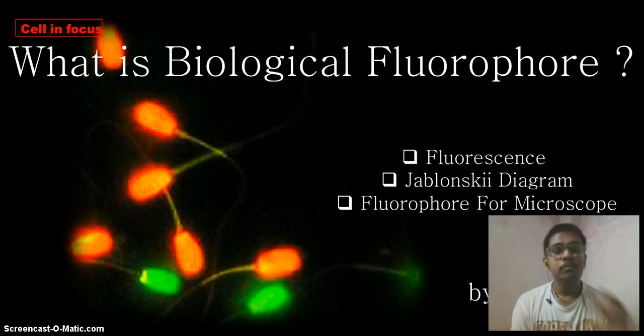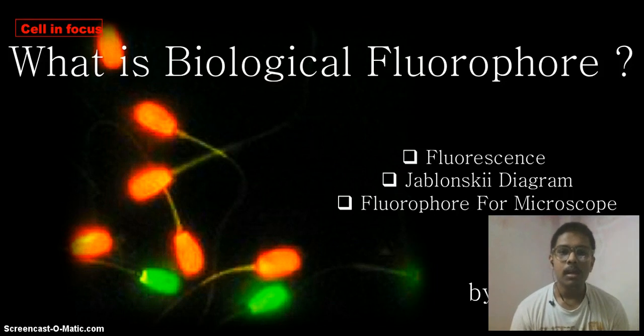To answer that, there is a phenomenon happening which we call fluorescence. The fluorophore is making that incident, that's why it's called fluorescence. Fluorescence is a molecular level phenomenon by which a fluorophore, an organic molecule rich in pi moiety, takes the excitation light and emits some other wavelength of light which is different from the previous one.